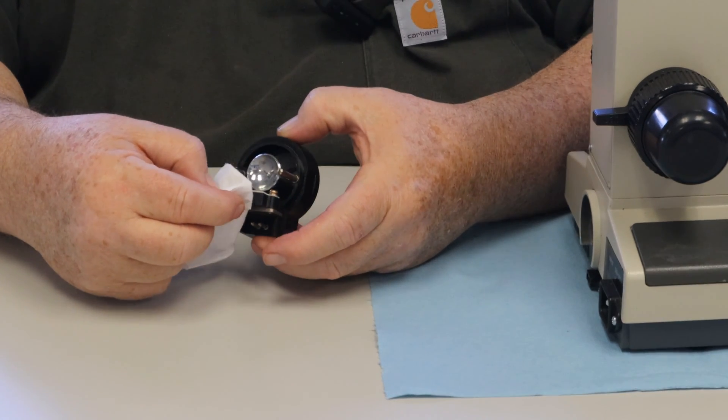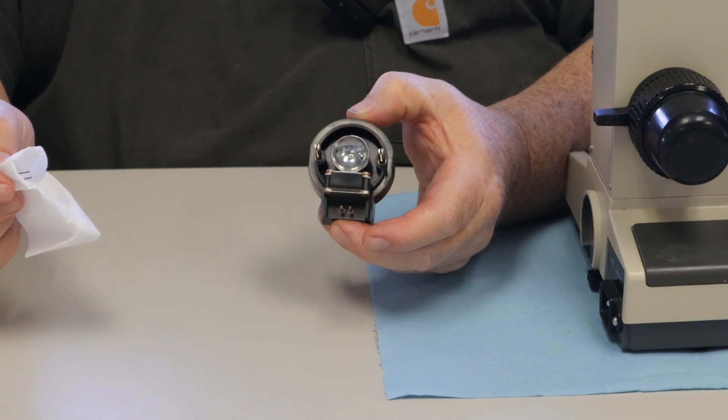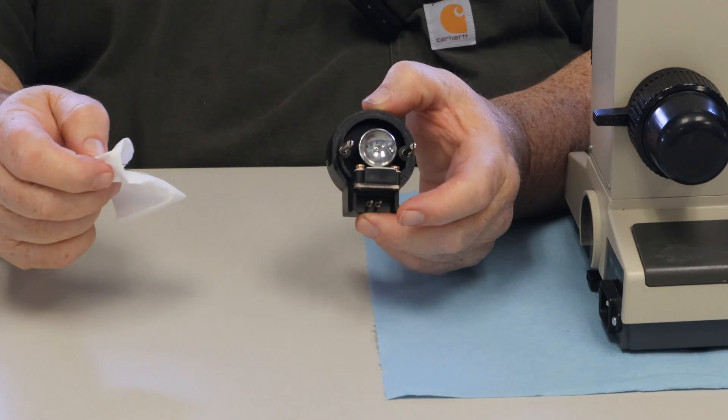If your lamp socket is discolored around here, that means your bulb has been arcing and you need to get the lamp socket replaced as well.